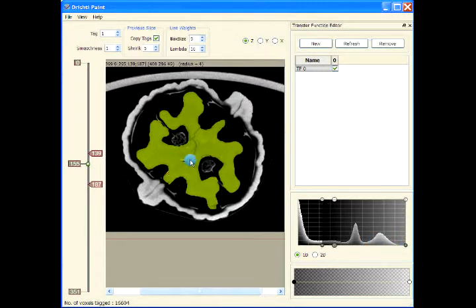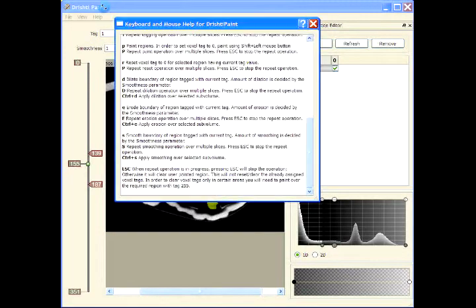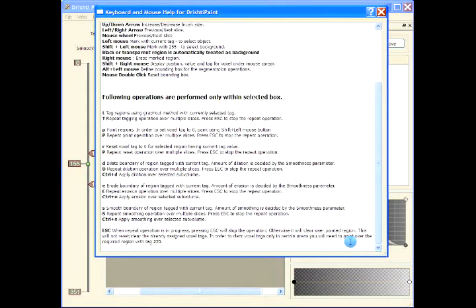Increase that, and I can press Shift T, so capital T. Let me show you what it does. Capital T will basically apply the tagging operation recursively to the slices. So Shift T repeats the tagging operations over multiple slices, and then you can stop that by pressing escape.